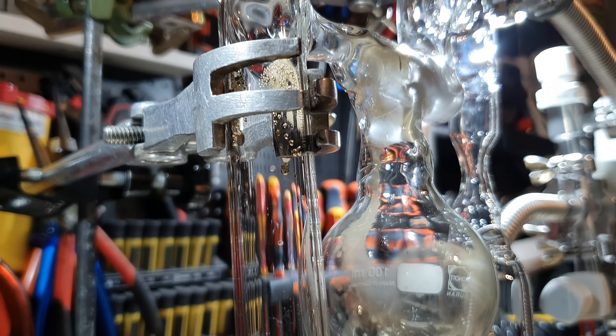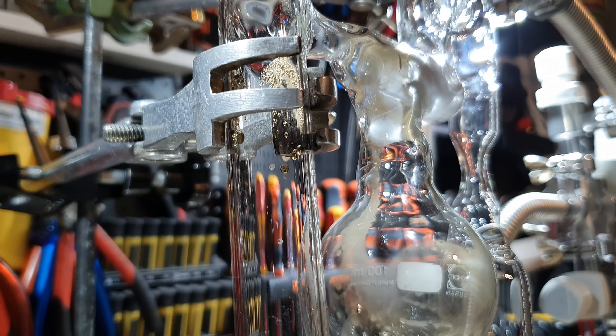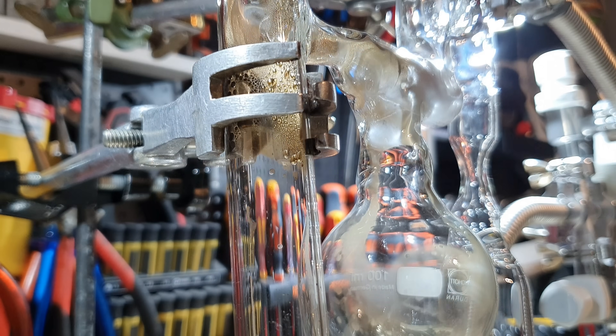I will now show you some beautiful shots of the first distillation. If you want to skip that, you can just click on the next chapter.